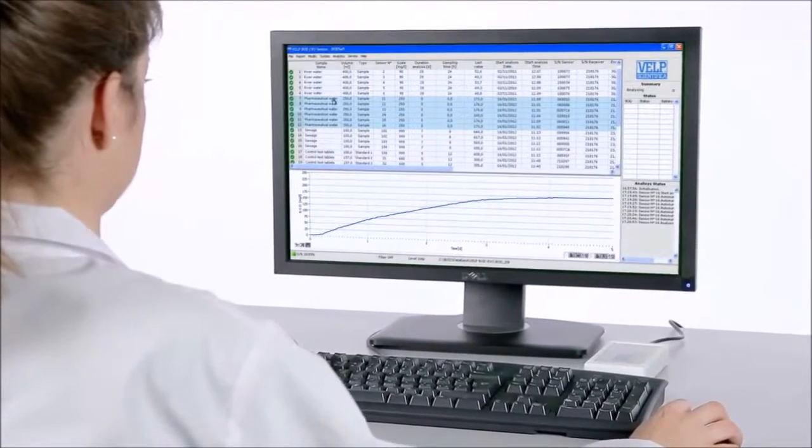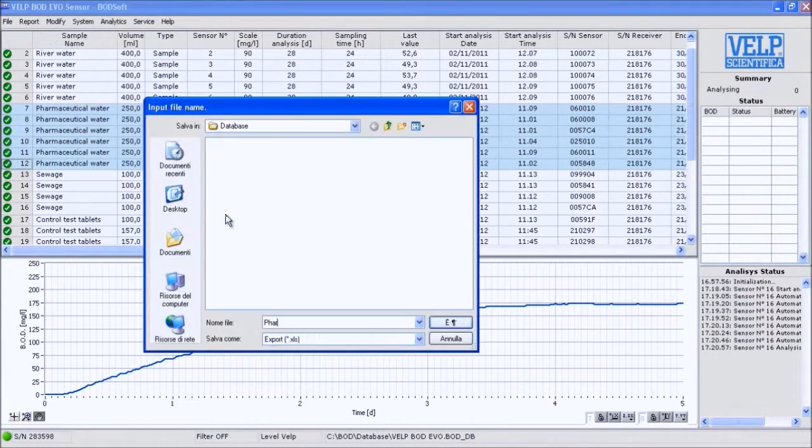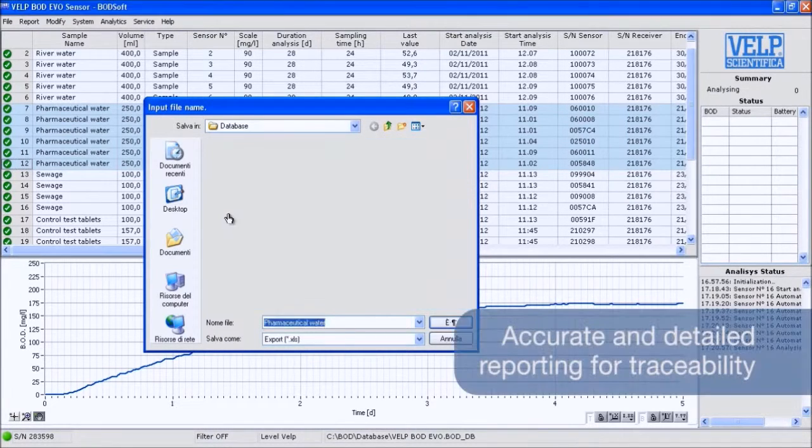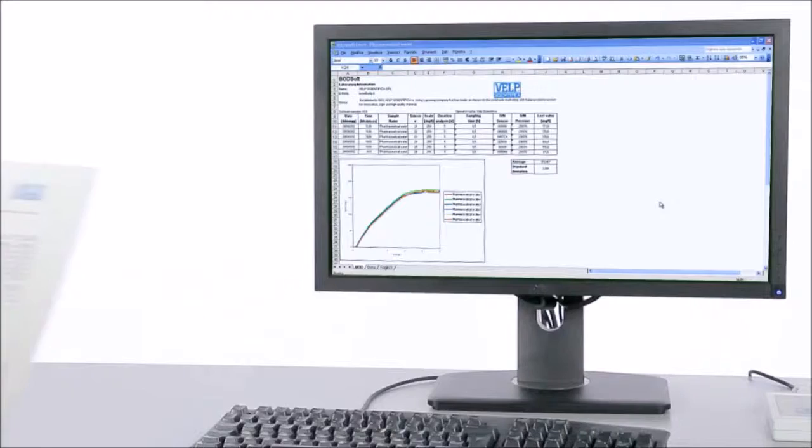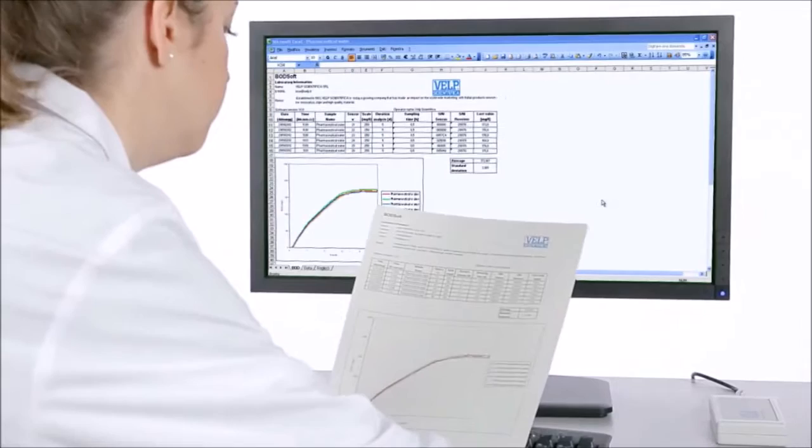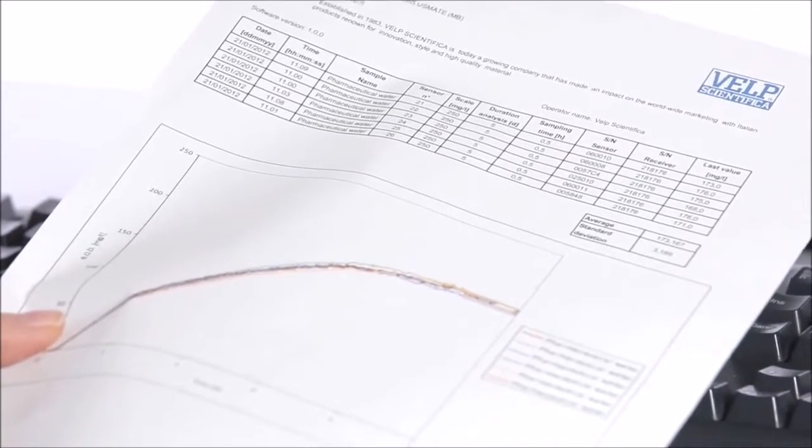Once the analysis is completed, all the results are stored in the database. They can be easily monitored, compared and exported in XLS, TXT and CSV format to PC for data traceability. Single or multiple customized test reports can be created. All the results and reports can be output to a printer or saved for GLP compliance.